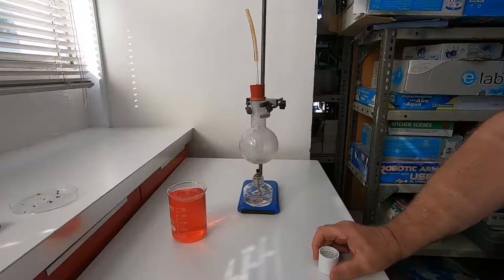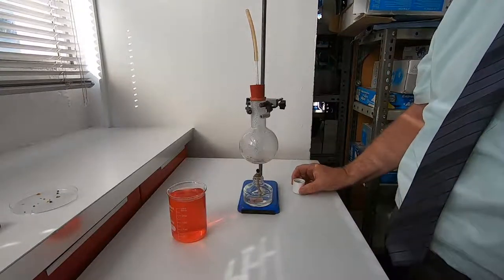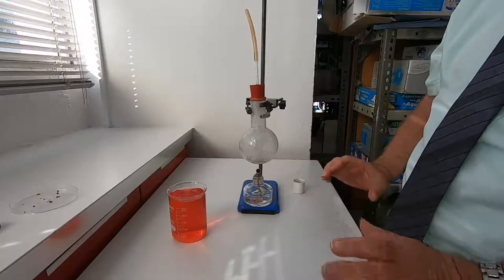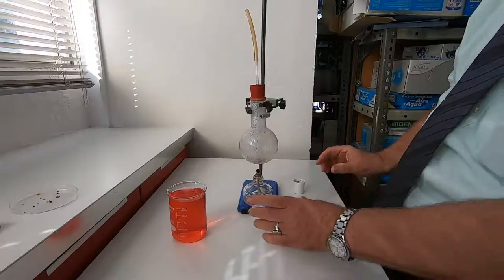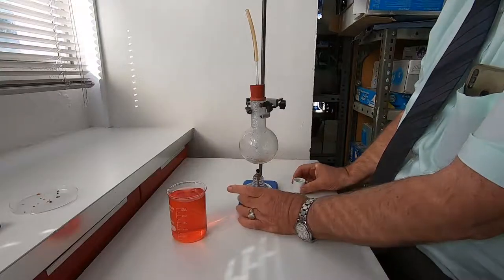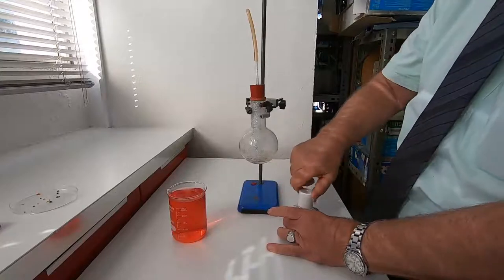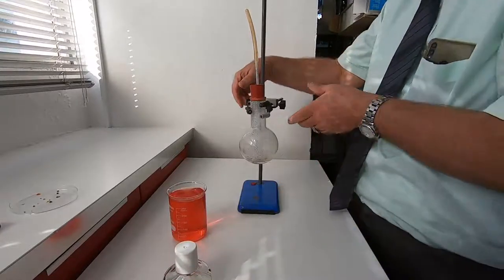Okay, you ready for that? We can just watch what happens now. I have to do it fairly quickly. The flame goes out — I need to lift this up.